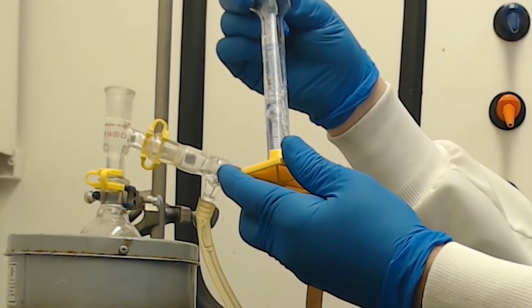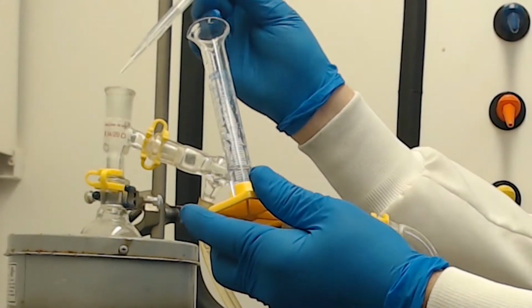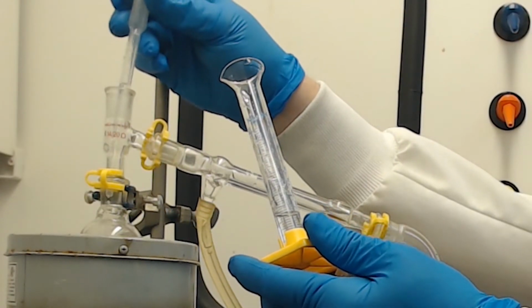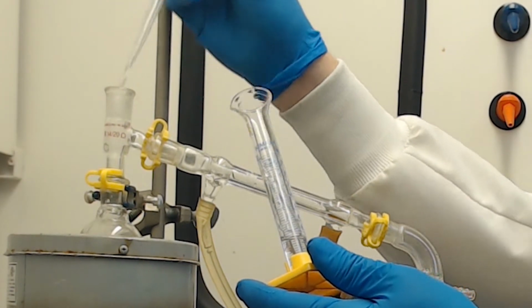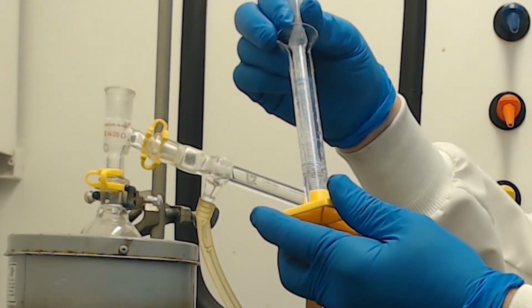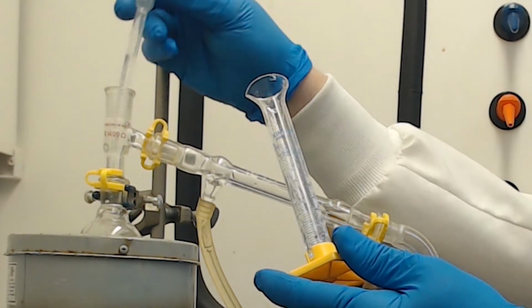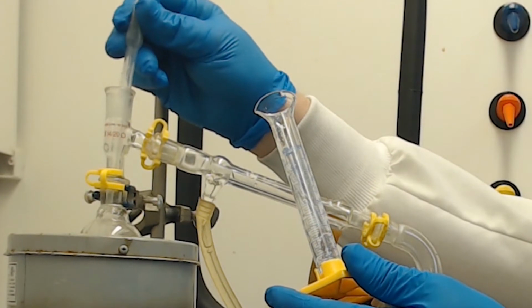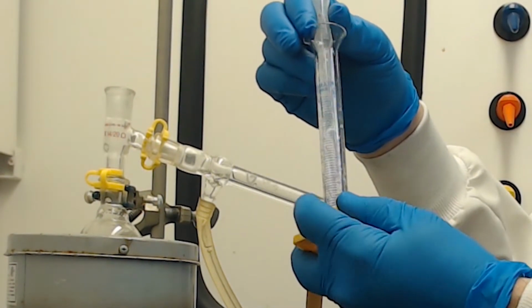Okay. Now you see I'm using this hood. I'm keeping the hood down as far as I can while I'm working with chemicals. We pretty much know what's going to happen here, but you never know if you're going to add something and something's going to go awry, and you're going to want that blast shield in front of you. So always work with the hood as low as possible. And I'm just adding this amount. There's a little bit left in here, it's okay.